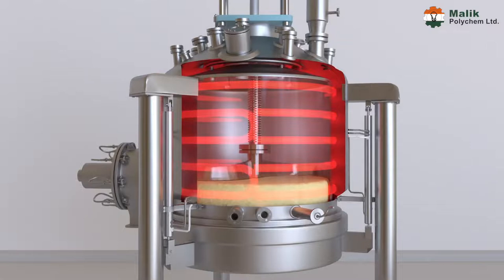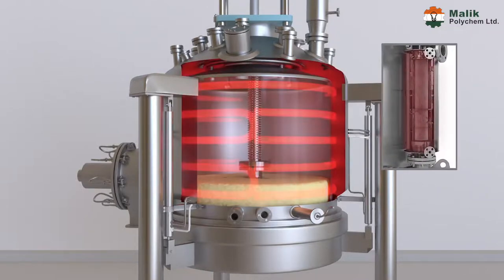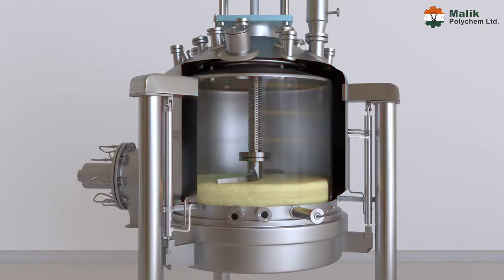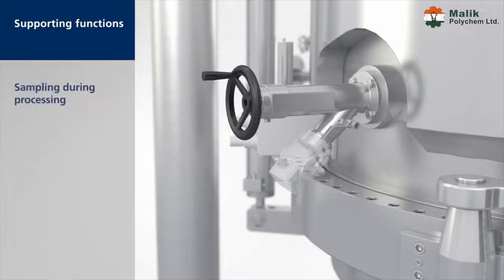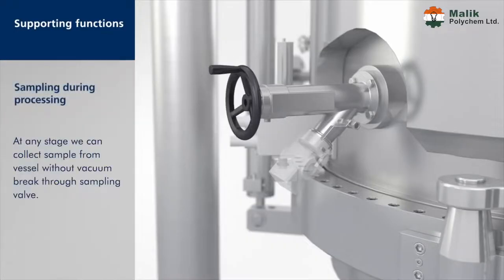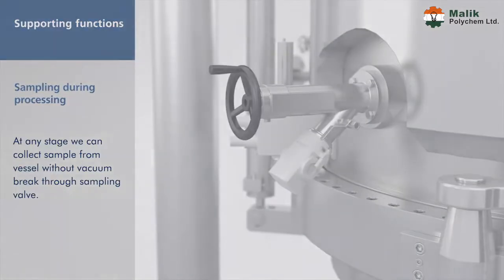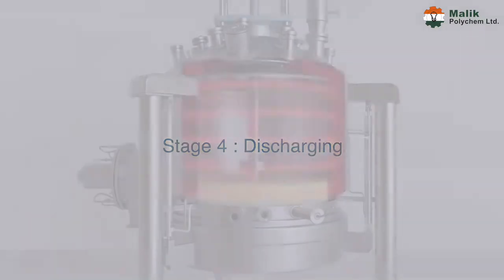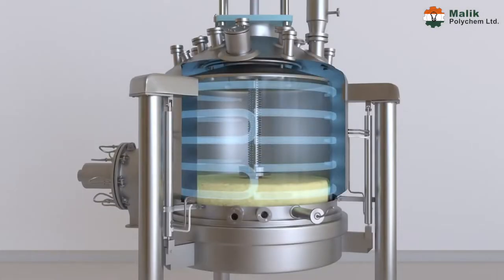Third stage — drying: in the drying process, vacuum is applied through a dust collector and heat is applied in the shell bottom limpet and also on the agitator, which accelerates the drying process while the agitator is still rotating. At any stage, a sample can be collected from the vessel without breaking the vacuum through the sampling valve.